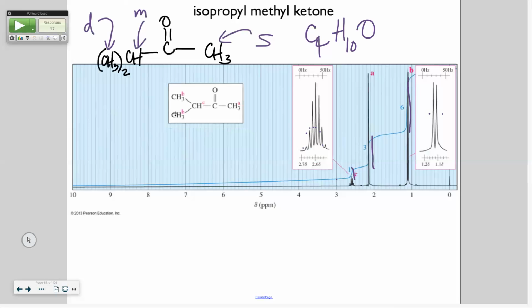All right, let's see. Okay. And I have written A, B, and C. I want you to notice which one is farther downfield. C is farther downfield than A. Even though they're both next to the carbonyl, you'll still notice they're pretty close. But remember way back in the dark ages of Monday that I showed you some shift values, and the carbons that are more highly substituted, those hydrogens were a little farther down. So that's where it's coming from. Okay. Okie dokie. How do you feel about that?